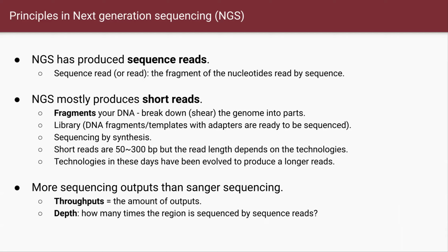And depth, as we discussed last time, if you want to read a certain area, how many times you read that, right? So just reading one time is not a very good thing. So you get 10 times, you get 30 times, you get 100 times. So you get more confidence out of this information, right? So this is an important thing.